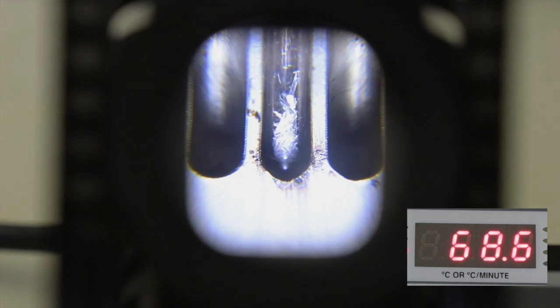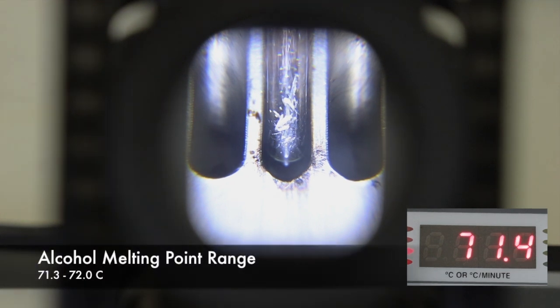I placed it into the machine well below its melting point of 72 degrees Celsius, just in case there were impurities and it started melting early. But the crystals didn't start melting until about 71.3 degrees Celsius and didn't finish melting until 72 degrees Celsius. So that'll be the melting point range for the alcohol product.